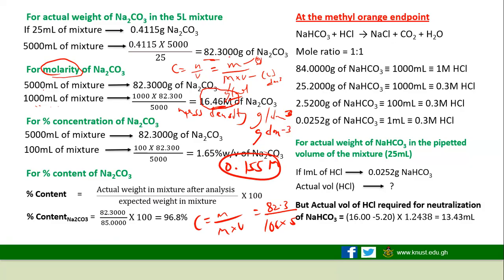This is it. Good. So if we want to actually find the molarity, then the mass density is equal to MC. That is, P is equal to MC. That is, the mass density is equal to the molar mass times concentration. Then we can say that the molar mass is equal to the P over C.